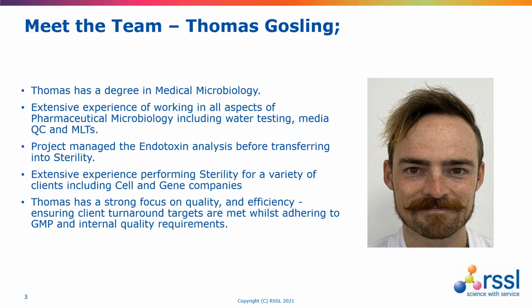So, Thomas, can you give us a brief overview of what your role at RSSL is? Sure. So I'm currently based in our sterility team, where I perform a lot of testing using our Grade A or ISO 5 isolators, and they're located in our Grade D clean room. I assist in the organisation of the laboratory and its workload to ensure our client timelines are adhered to. I also do a lot of the sterility validations. This can encompass everything from a simple method transfer all the way to troubleshooting complicated or new products. I create the protocols and methods and create these into finalized testing reports.